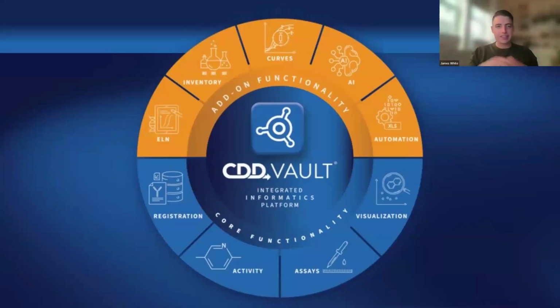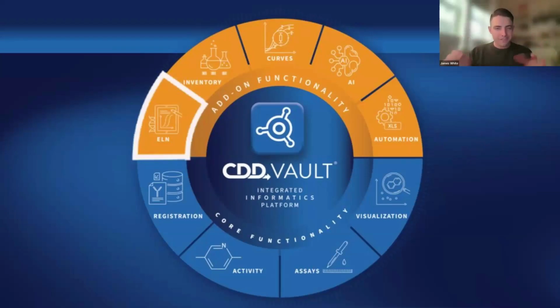Next, we're going to be moving into the chemistry ELN workflow enhancements. So we're increasing efficiency and consistency here. You're going to have streamlined reaction setups with clearer input fields and automated property carry through, enhanced integrations between reactions and registered entities, so you reduce those duplications of effort that you might be experiencing. Better template management to support repeatable workflows and standardize your team's practices, as well as expanded visualization options to make it easier to review experimental context directly within your lab notebook.